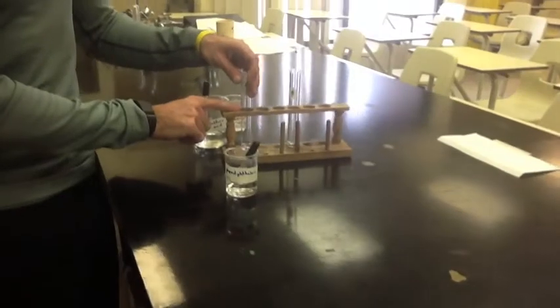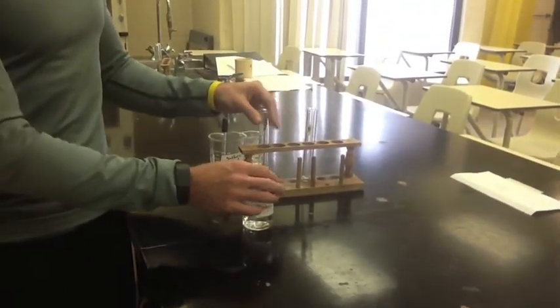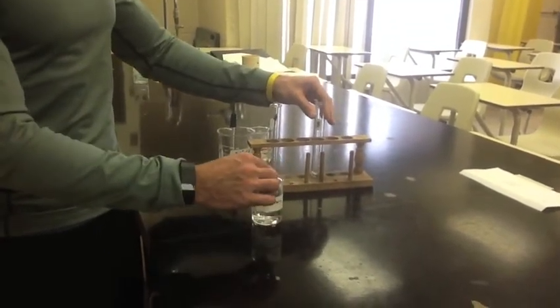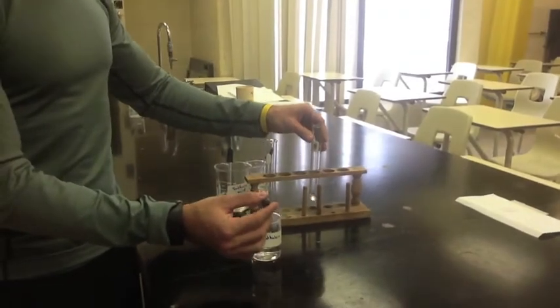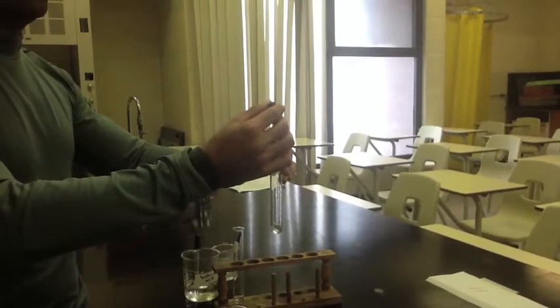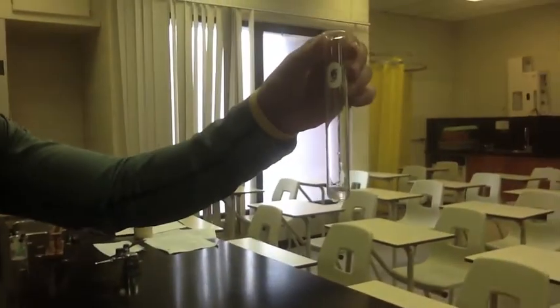So I'm actually going to show you this demo. What we have here is the sodium hydroxide and the sulfuric acid. This was the first beaker that I filled up. This has the base. This has the acid. What we're going to do is take a drop or 2, and that's all you need, of phenolphthalein, just tiny little drops, into each acid or base. So we're going to drop 1 or 2 drops. Okay, we're going to shake it up and make your observation.